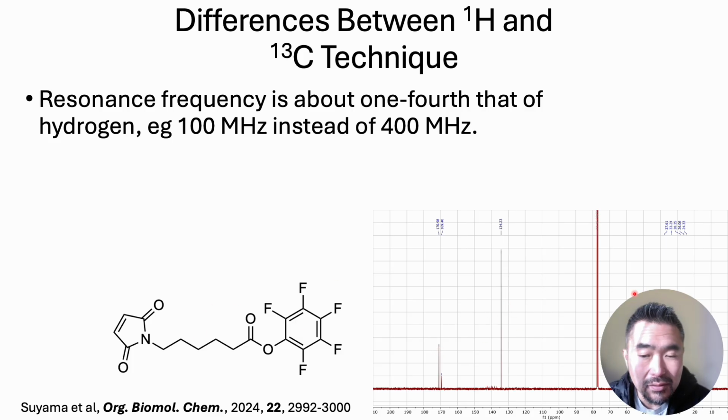Well, the 5 peaks over here are in the alkane range, and not too surprisingly, they're these 5 carbons. The one tall peak is this peak, partly because there's a symmetry here, so both of these 2 carbons give rise to the same single signal, and so it's a little bit taller than the others. The smallest peak here is actually this carbonyl ester peak.